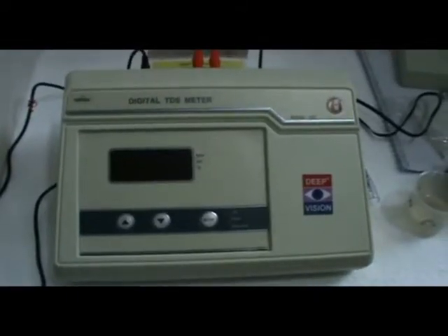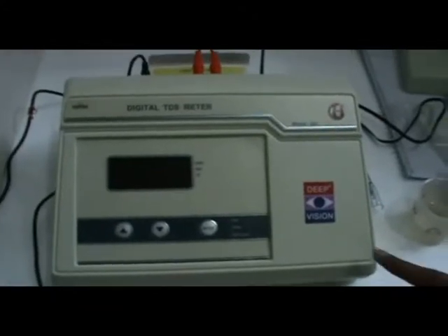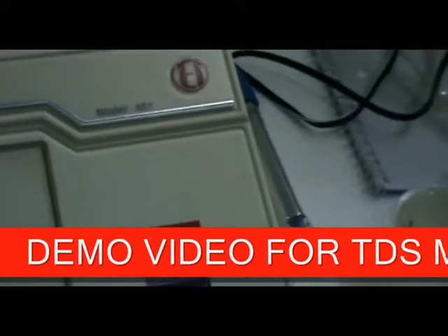Demonstration for the TDS measure model 651. Accessories include the TDS meter, TDS cell, electrode stand, dust cover, and instruction manual.